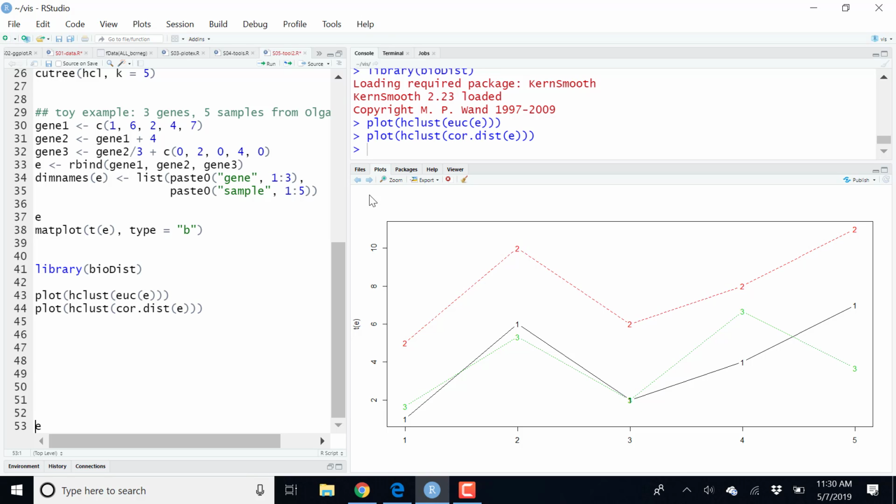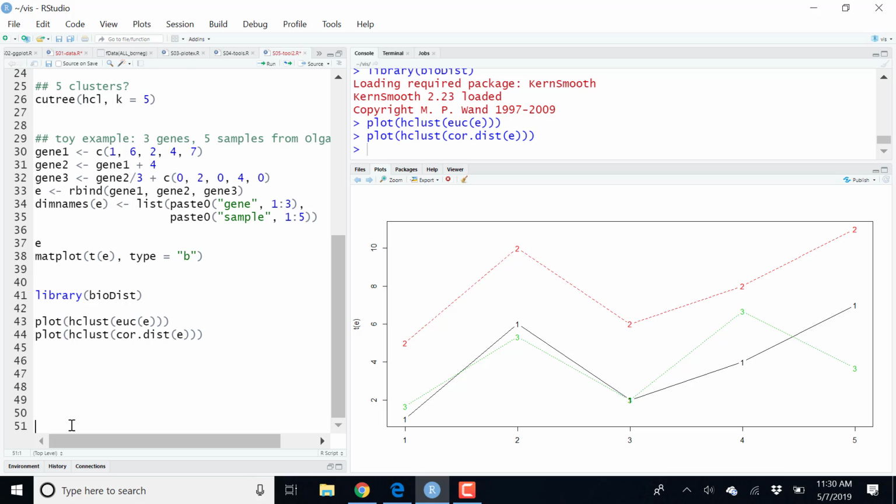So this is to show that in clustering in particular, but in general, many different algorithms that we look to use, exactly how we process our data, what kind of assumptions are made about the data will influence our results. And certainly when we have thousands of genes that we look at, we want to have a big picture. There is no way we can start to pick up on cases like this. And so typically what we would want to do is to scale our data.